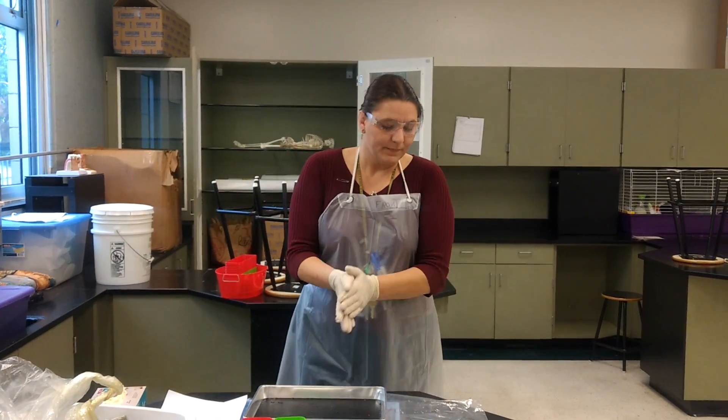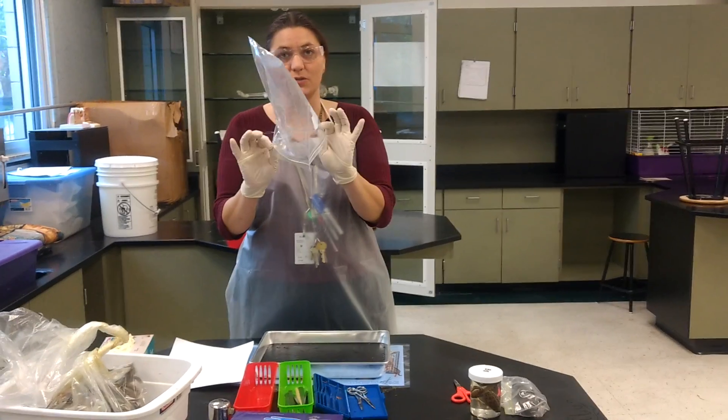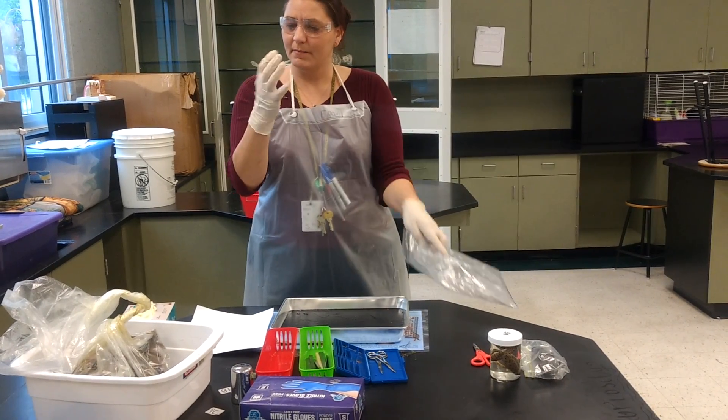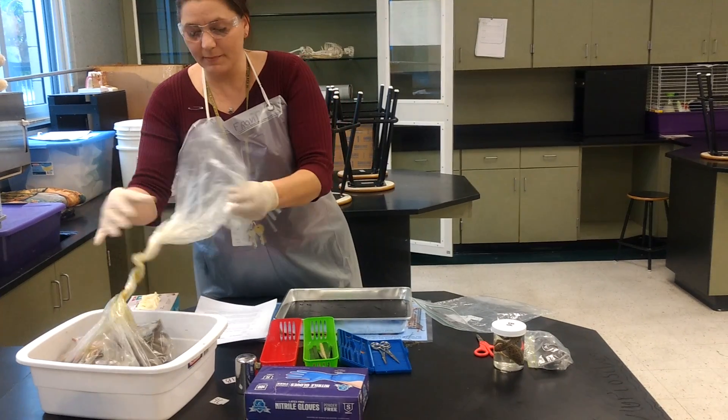Now that it's dissection day, I also have this bag because the dissection is going to take two days. We're going to need to make sure that our frogs go back into the bag at the end. Gloves on — make sure you have no slices in your gloves.